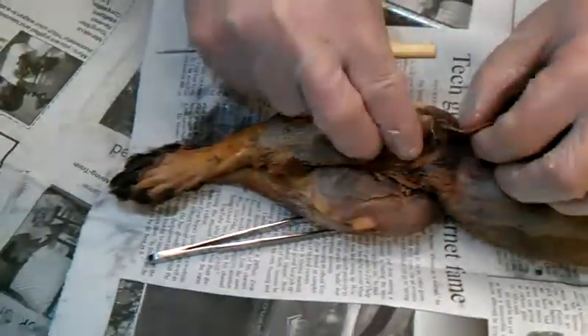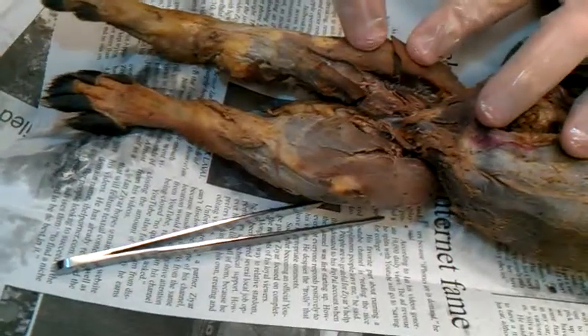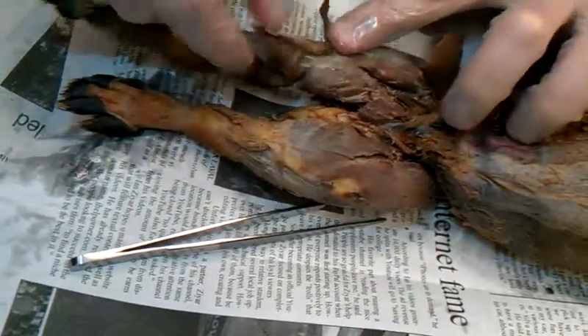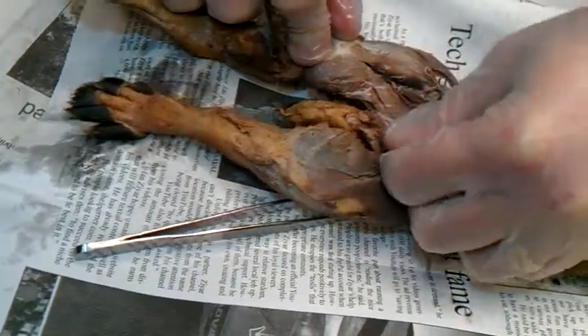Alright, back into the medial aspect — the adductors. You guys cut that muscle which is called the sartorius, and you cut this muscle which is called the gracilis. Now all these adductors.